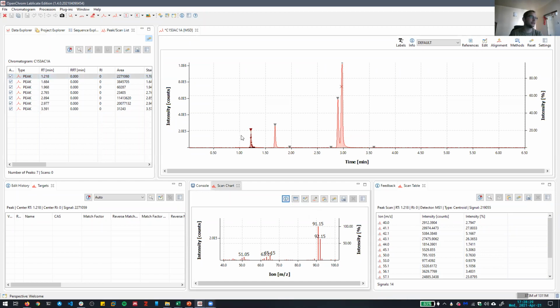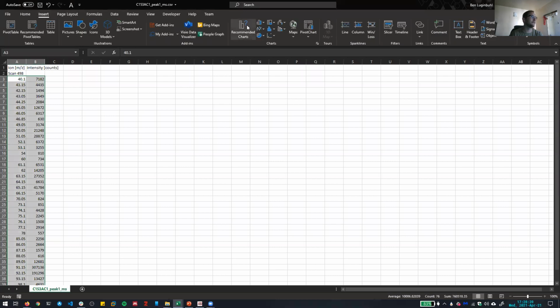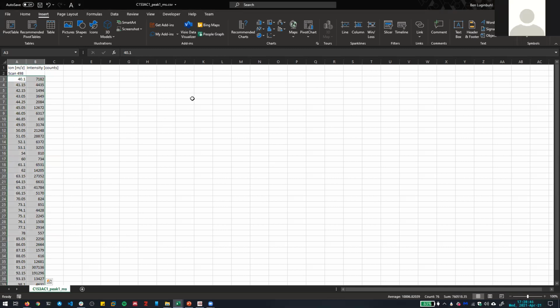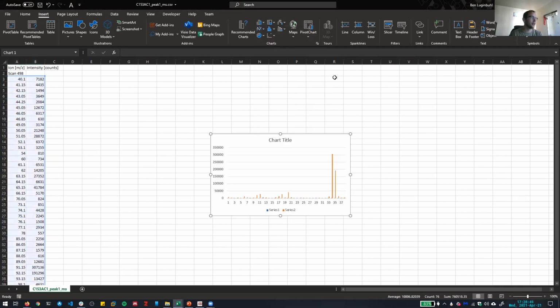So we used a connected scatter plot for these data here, which makes sense because it's continuous. But what about this? Anyone have an idea? Could you use a bar graph? Yeah, we'll use something like a bar graph or a histogram.